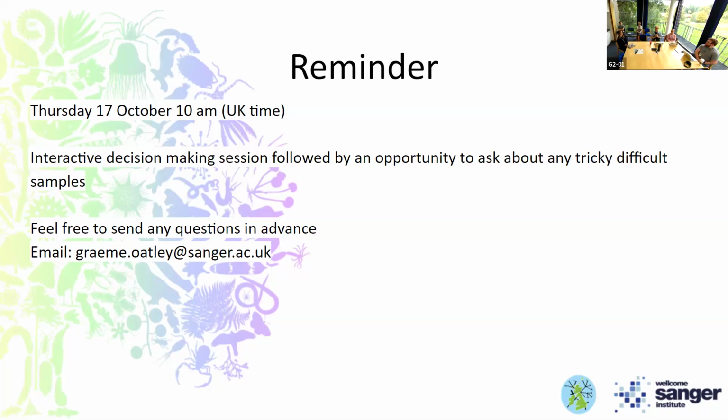And then I think the adjustments we've made to that have been to also use those sponge cells for Hi-C sequencing. So I think previously that method was only used for DNA extraction, but we've also found that squeezing sponges into a nice pellet has also proved relatively successful for getting good Hi-C data from sponges.